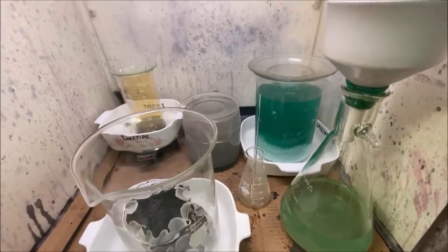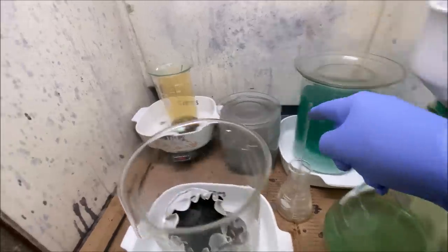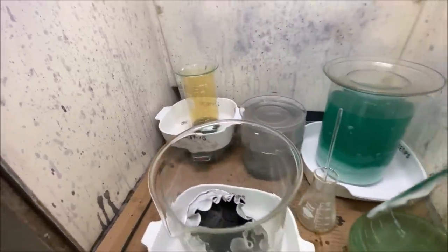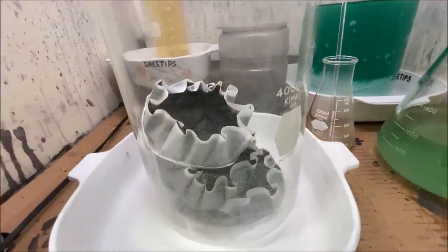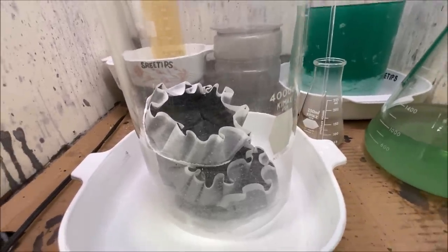All right, let's review what we've got here. We've got our silver sulfate. I'll convert that to silver chloride with hydrochloric acid and then to pure silver with lye sugar. We'll melt it up into shot, run it through the silver cell. Back here I've got our little button and we're parting out the silver and base metals with nitric acid. And in here we've got our filters. And what we'll do in part three is go ahead and start processing this solid material now that we've recovered it in Aqua Regia.